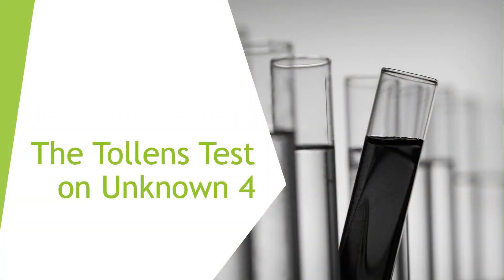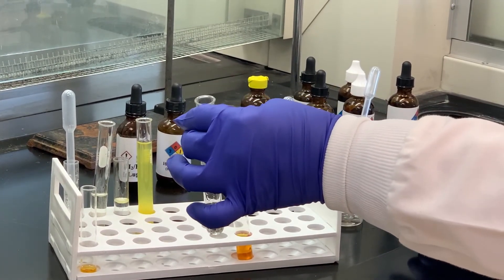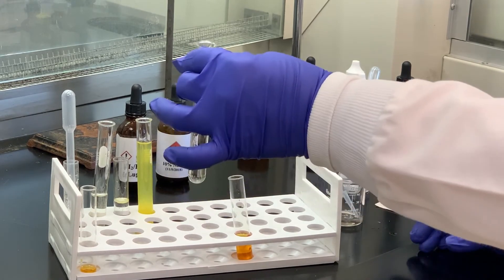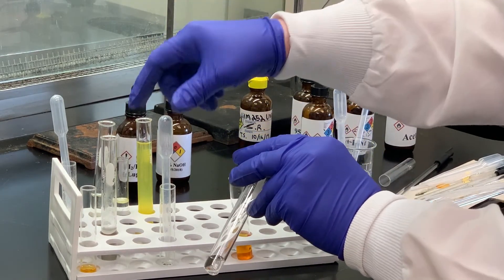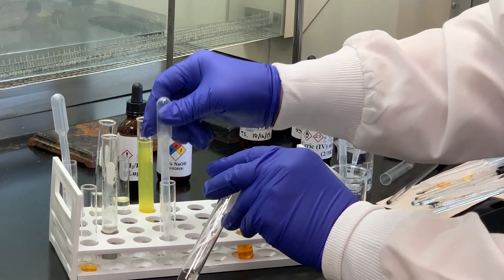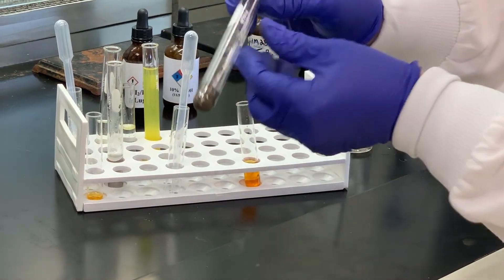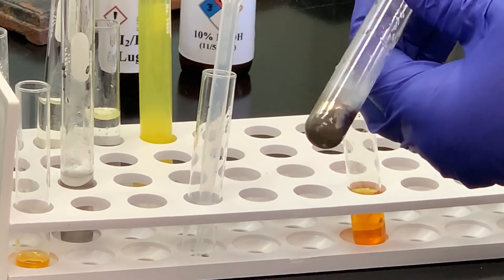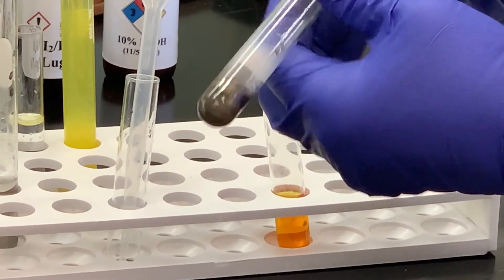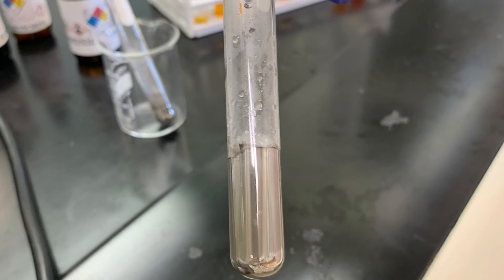The last test we're going to do is the Tollens test. What I've added to this test tube is the Tollens reagent, which is a mixture of silver nitrate, sodium hydroxide, and ammonia. I have a few milliliters of Tollens reagent and I'm going to add some of our unknown to that. Can you see the silver mirror forming on the side of the test tube? Yes, that's perfect. Remember, the Tollens test — if you see the silver mirror — is indicative of an aldehyde group.